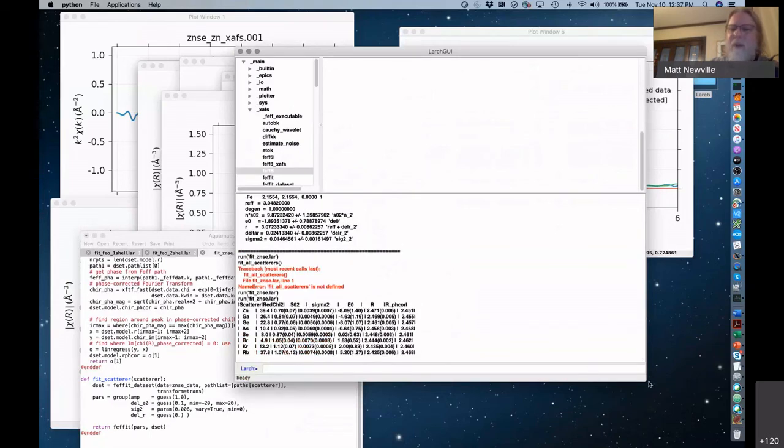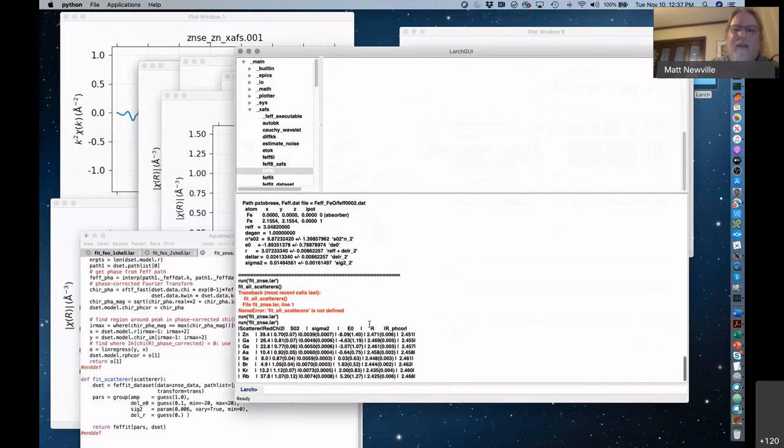So what I plotted here, or included in this table, is the distance that we refine, the 2.47 plus or minus 1, and this value of where the phase shifted imaginary part crosses 0. And those should be consistent. And if you look at the selenium plus or minus 1, you can see that they're kind of close. They're within a couple of hundredths of an angstrom. Actually, the best one is actually arsenic.